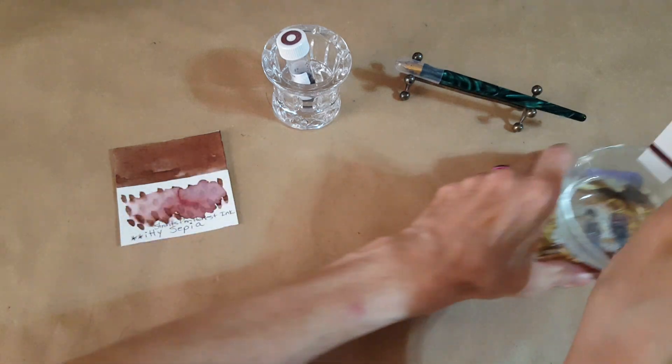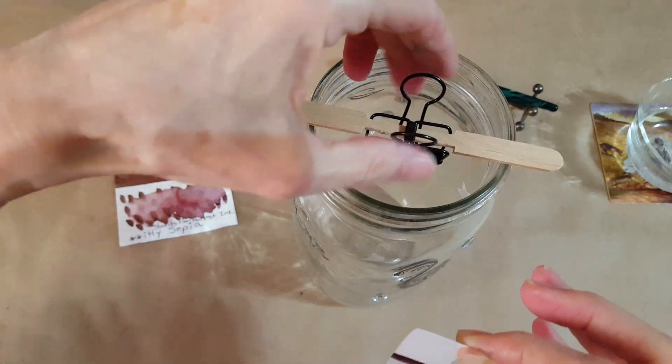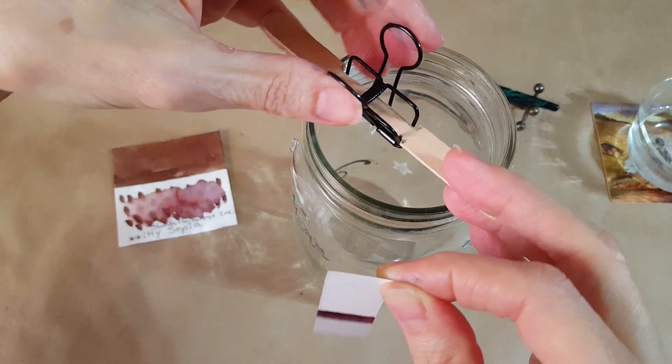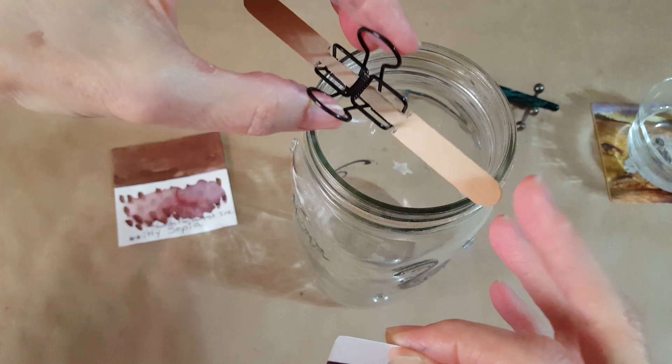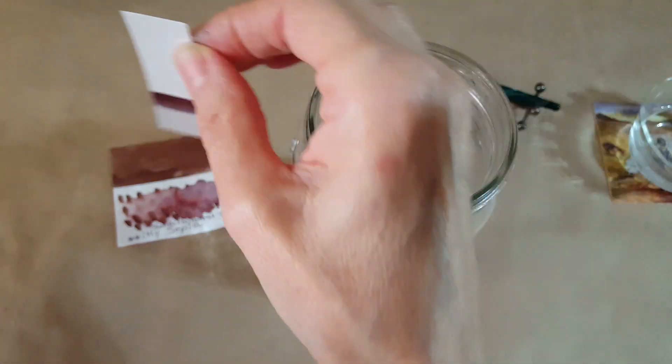Now the next thing I do, let me move this out of the way, you need to kind of keep it vertical like this. So I have this little gizmo that my husband made. It's a clip with a popsicle stick he cut. So all I do is just clip it on there.